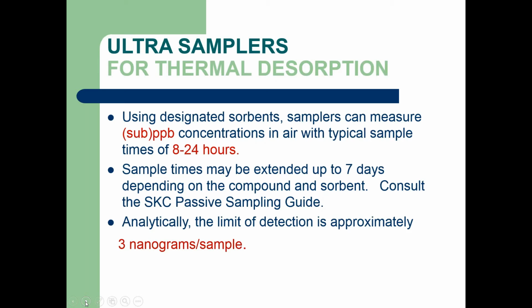Analytically, note that the limit of detection is typically around 3 nanograms per sample, very, very low detection limits.